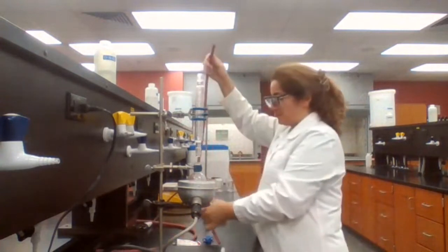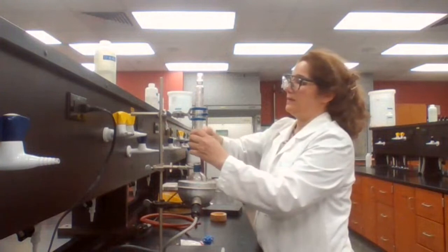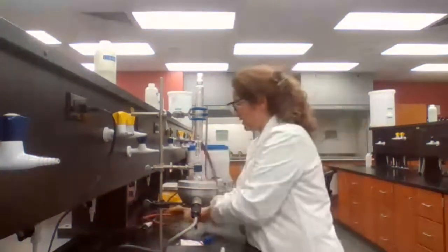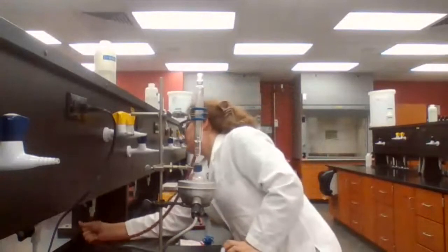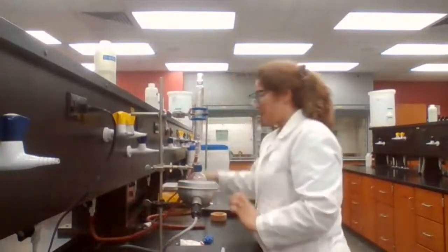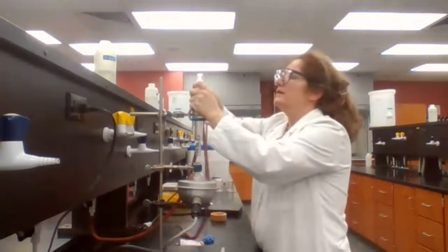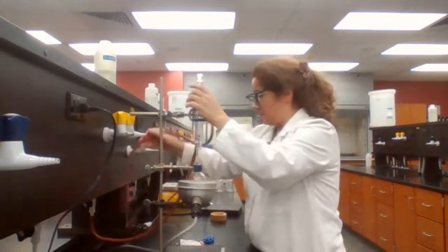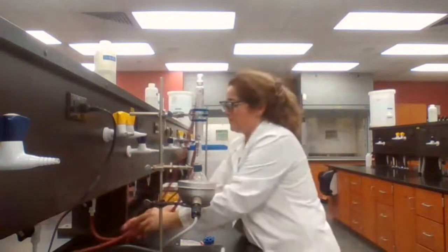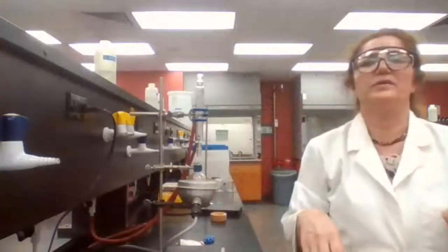Water hoses: the lower end is water in. So I attach the lower end to the faucet for water in, and the upper end would be used for the water flow out, so it would go down the drain for disposal.